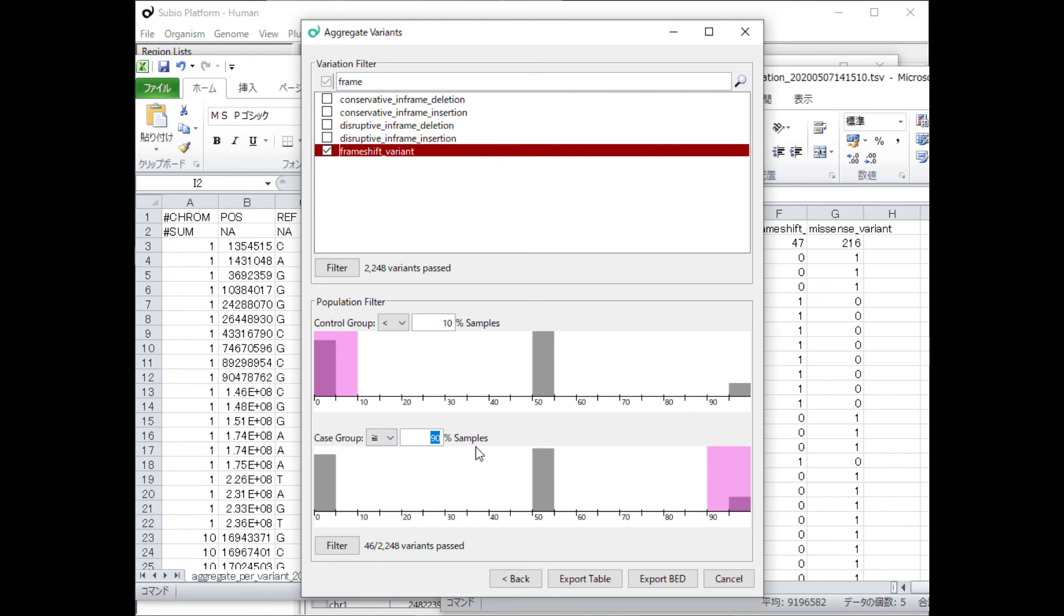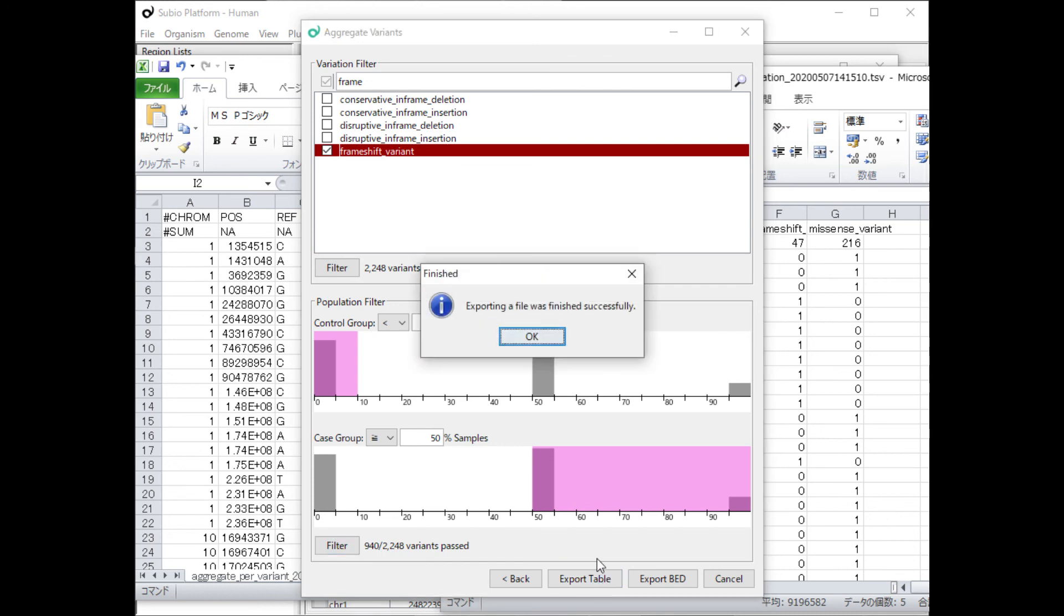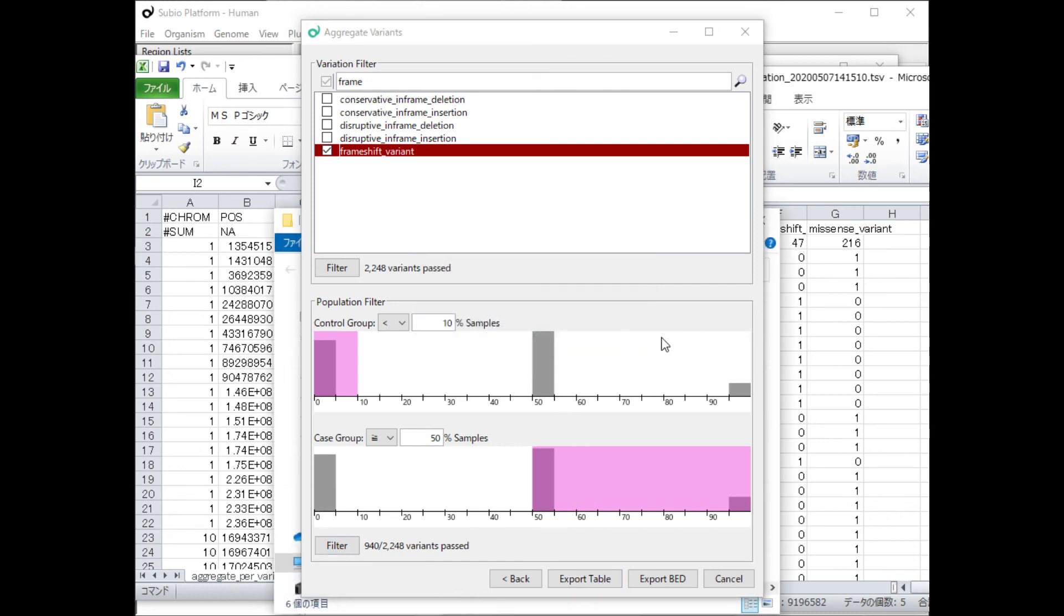We also extract mutations contained in either one of the two mutant samples, changing only the setting of the population filter.